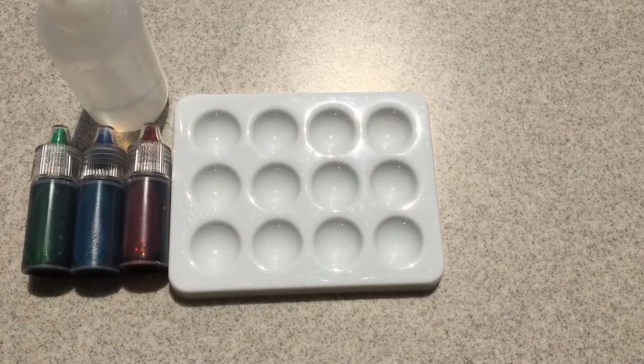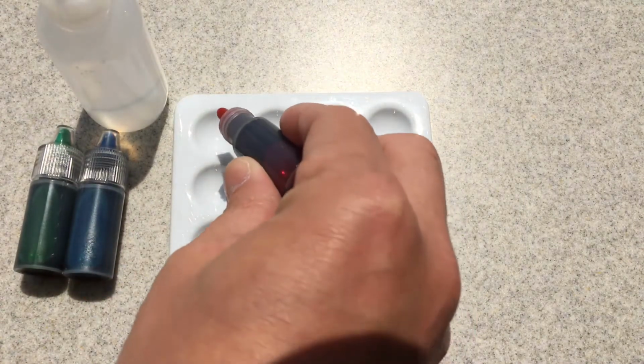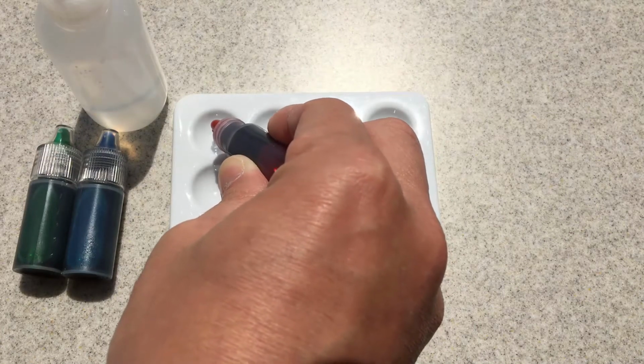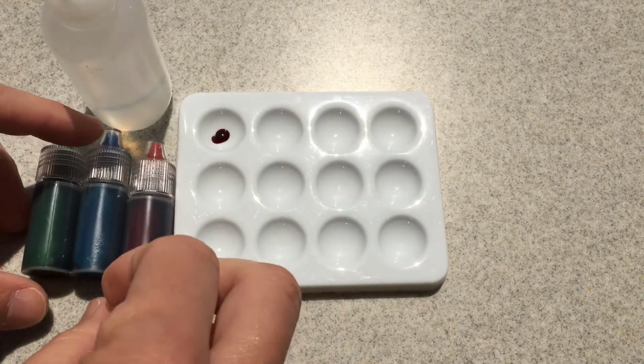This is the Clean Air Challenge Concentrations Lab. We're going to go ahead and do it 3 times, once with red dye, once with blue, and once with green. Things have been sped up a little bit to make sure that we can add all the drops very quickly and not waste too much time.